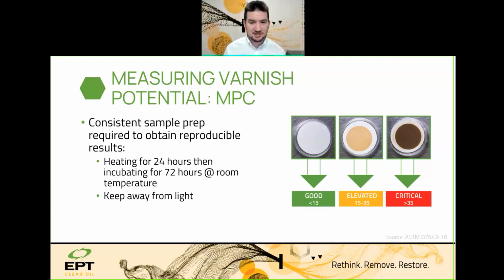And again, it's this insoluble varnish that we're capturing on a filter patch. So this is what's detectable. So the heating step is intended to kind of reset samples when they are received by a lab. Because again, I've seen samples that literally arrive in our Fluid Technical Center hot from the turbine. They've been drawn within the hour. And I've seen other samples. This one's an extreme example, but I saw a sample from 2018 that just arrived last month. I have no idea how long that's been sitting on someone's desk and shipping or who knows what.